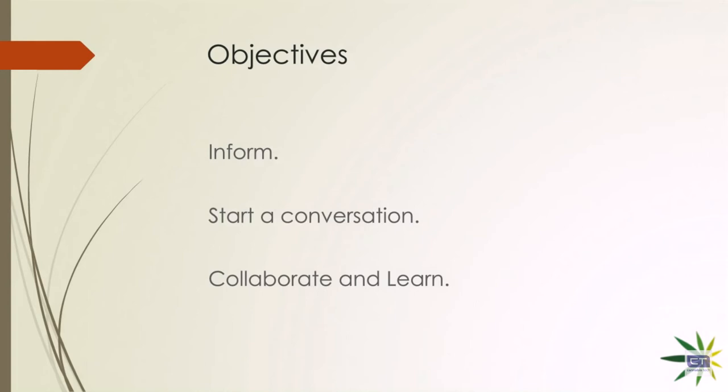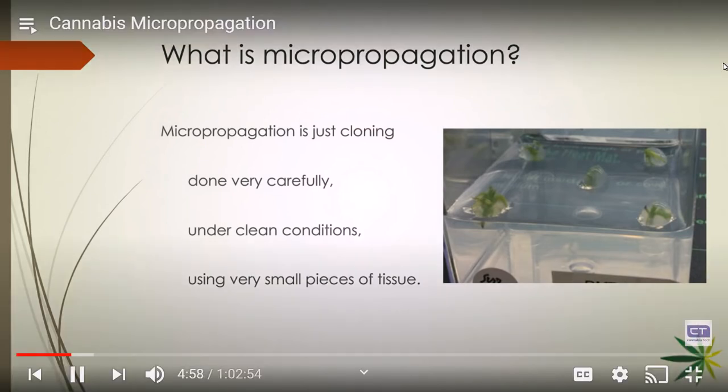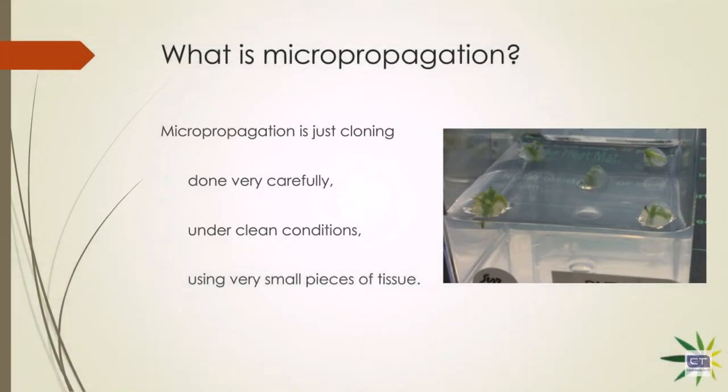What is this micropropagation? Explain to us what this is. What are we talking about today? Micropropagation is almost exactly what it sounds like. It's propagating a plant. Cloning, as we know in the cannabis industry, I don't think I need to explain to this audience why we do it and what it is. Micropropagation is just cloning, except that you use incredibly small pieces of tissue. It's just one of many methods that fall under the umbrella of plant tissue culture, which is a commonly used umbrella term. But micropropagation is a precise term that describes a very specific method.